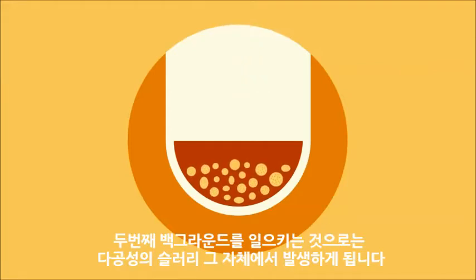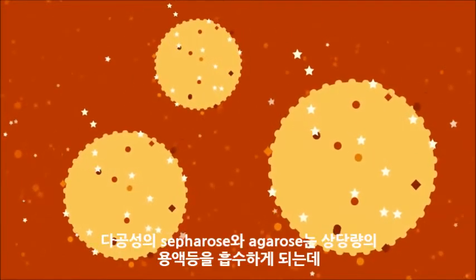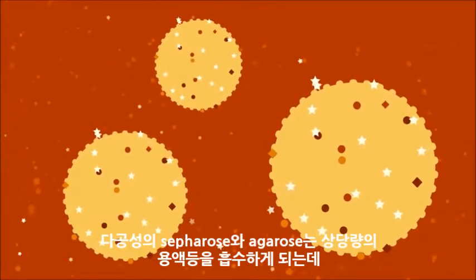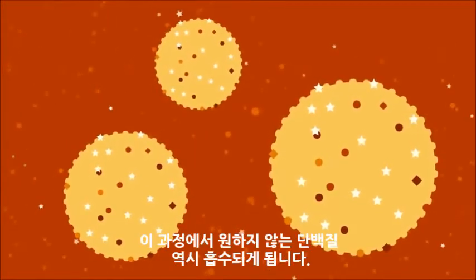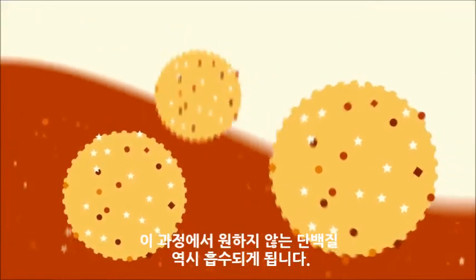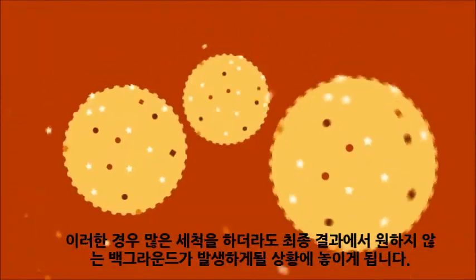The second source of background comes from the porous slurry itself. The porous Sepharose and agarose means a lot of liquid gets trapped. Unwanted proteins are therefore also trapped within these pores, and even with lots of washing, you run a high risk of ending up with that unwanted background in your final results.